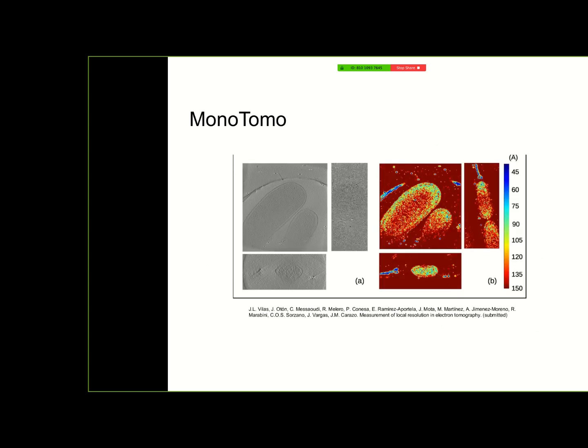And as one of our own research topics, we worked on the determination of resolution. We started in single particles, but then we found a way to extend that concept to tomography, and then you can define for a tomogram which parts have better resolution than others, and then you may decide to take your particles, your 3D coordinates, from those regions that have a higher resolution.